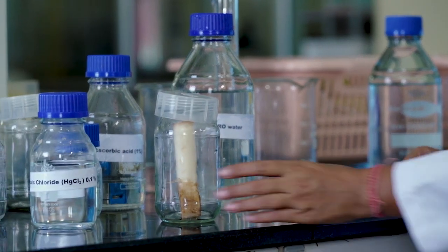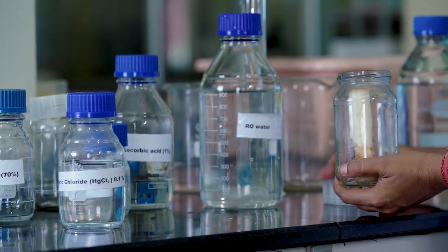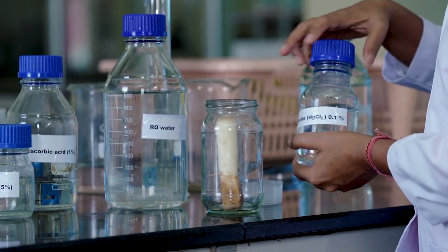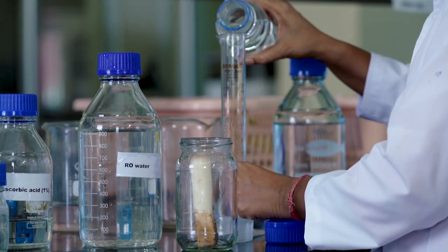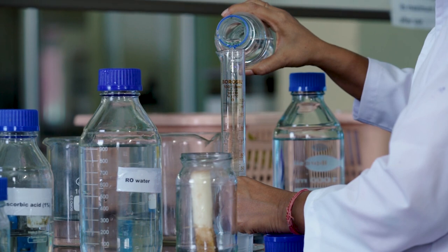Now the explant will be treated with mercury chloride solution. In this case we are taking 0.1% mercury chloride solution to treat our explant. There are various chemicals to treat the explants, such as mercury chloride and sodium hypochlorite.